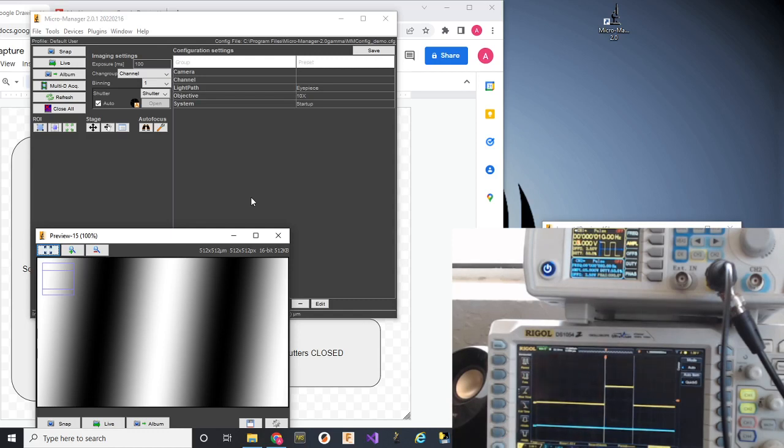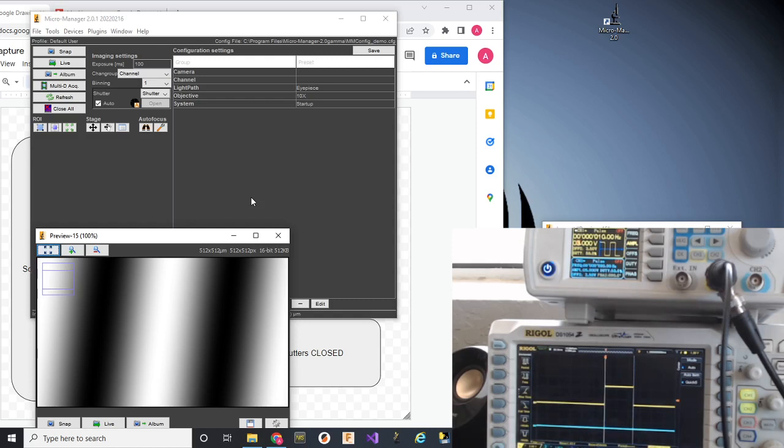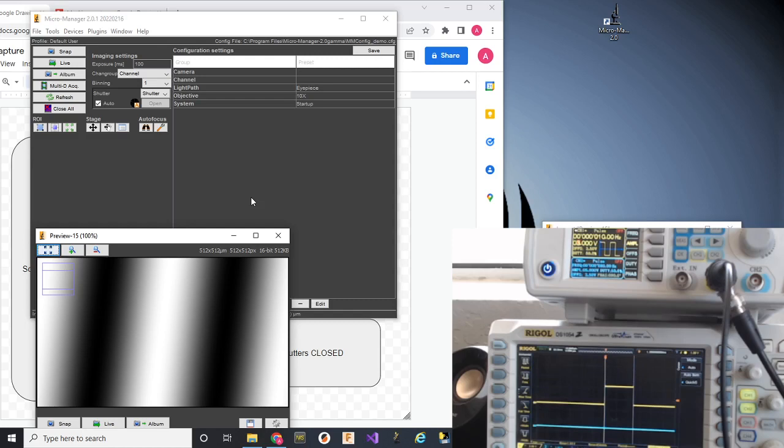Here's the interesting thing about this output. My exposure time was specified for 100 milliseconds. The yellow labeled position, we have a width, and that's the pulse width. That width is reading 124 milliseconds for that exposure. This is a 25% software overhead directly related to the fact that if I'm writing control software, the one thing I don't want to do is have the camera take a picture when the device for illumination isn't even in position or isn't even on.